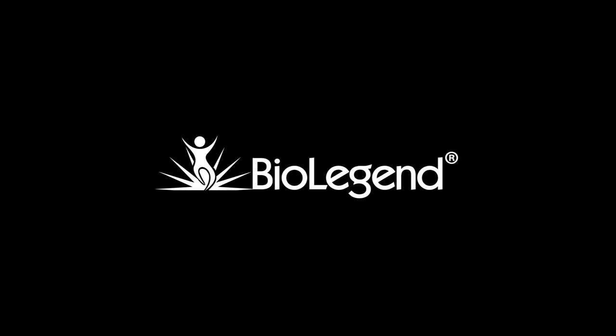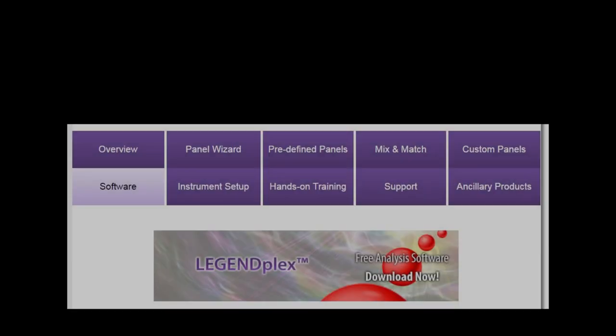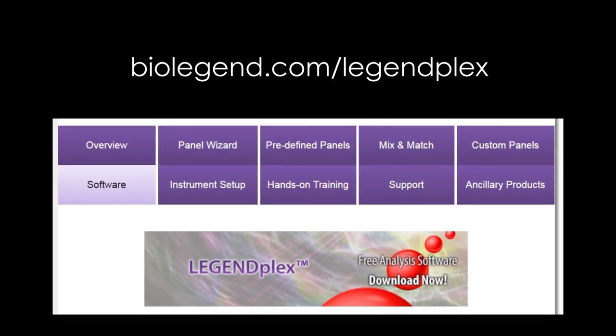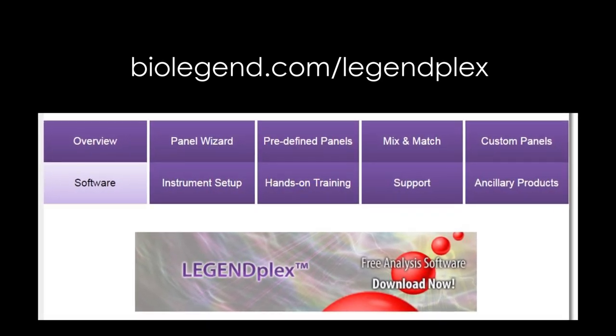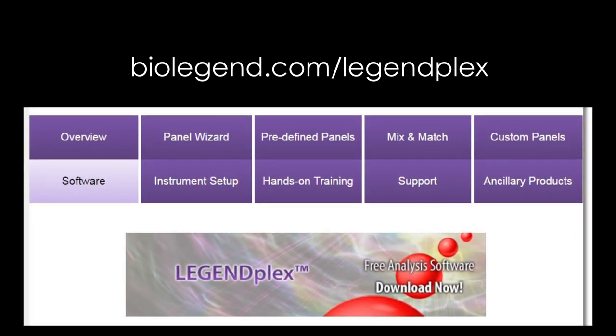Welcome to the video tutorial for version 8 of the LegendPlex data analysis software for Windows-based computers. The software can be downloaded free of charge from under the Software tab on our website at BioLegend.com/LegendPlex.